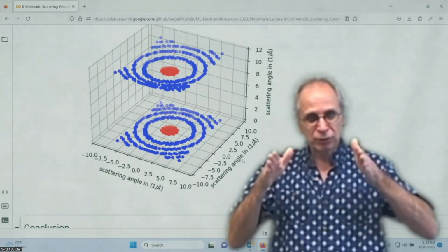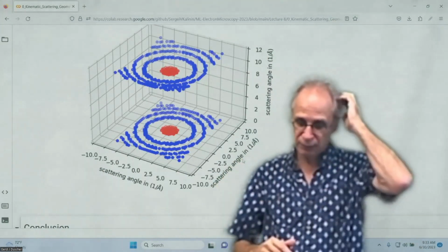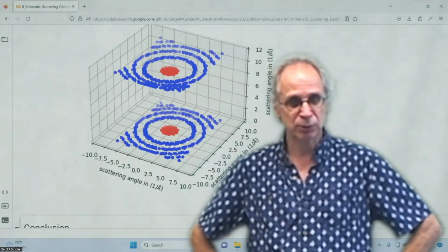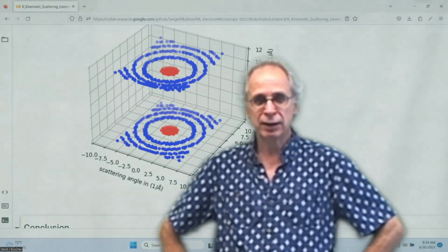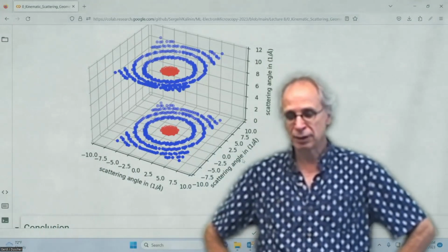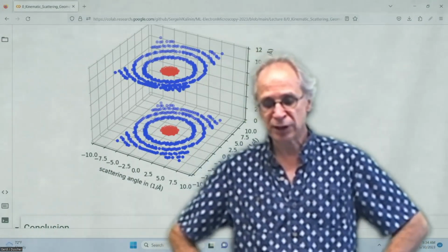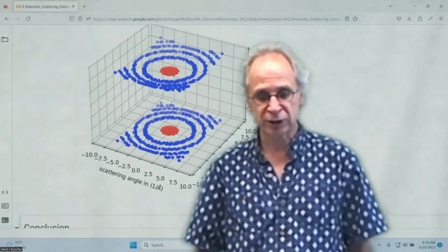What you really would have to do is, where does this deflected beam hit a plane? So that's what we really do. But these angles are so small in an electron microscope, you can ignore that, and that saves you a very time-consuming projection step.